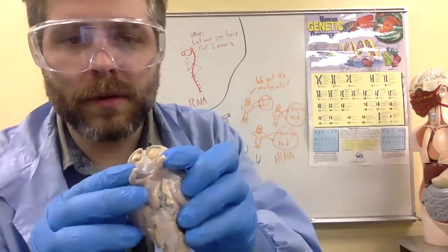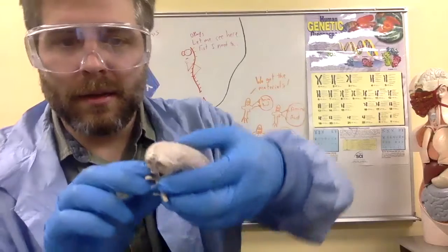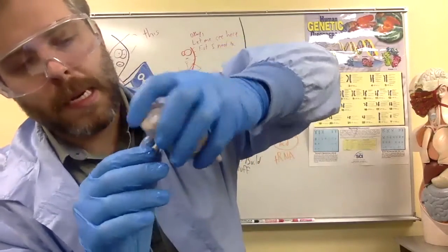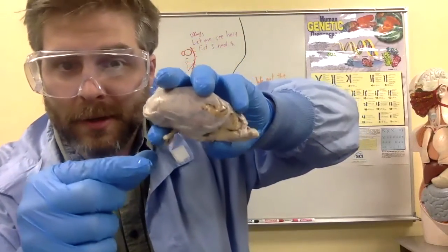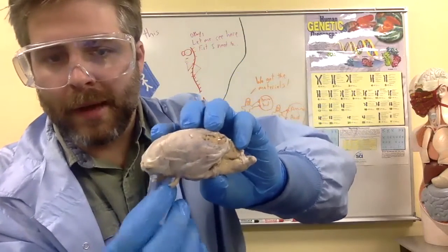These two nerves are called the optic nerves. Eyesight. So as the sheep stands like this, these nerves, if I can actually position it, are sticking out and go attached to the eyeballs. So the sheep's eyes would be right about here.